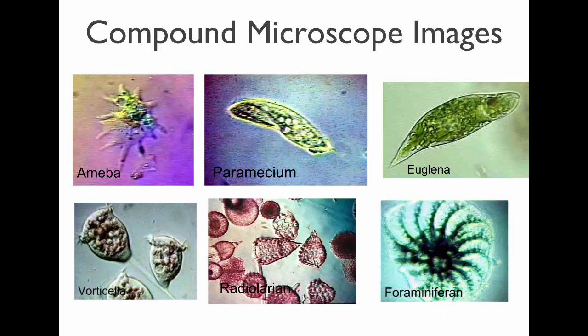They come in varieties, and they sell toy microscopes that are smaller and made of plastic, like at Toys R Us sometimes, and they're hard sometimes to get working well. These are made of metal, and they're a little more durable and higher quality, so it's much easier to use that type of microscope.